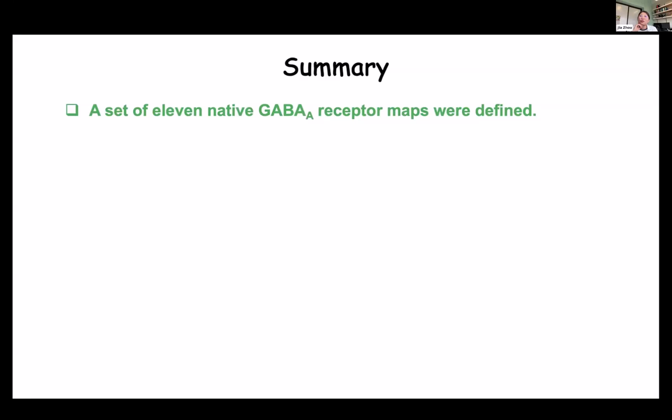From 20 grams of brain tissue, finally we can get the protein concentration pushed to 6 milligram per ml. But it's just maybe around 30 microliter of final protein. The yield is not that bad. For the cryo-EM, when we first tried to figure out how to make it work, it was pretty challenging. But finally, it turns out to work pretty well. And that's also the reason why we can see so many different compositions, because we have a pretty high concentration of the protein. So yeah, we can see so many compositions of GABA receptor.